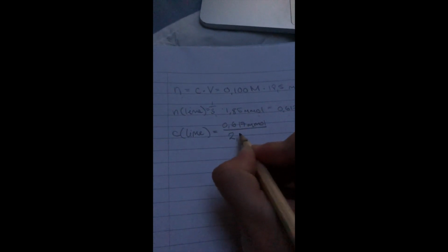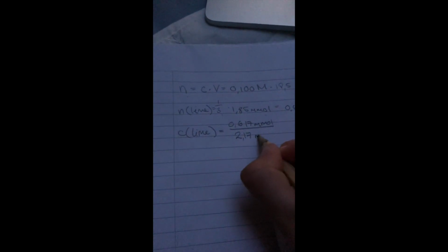So to calculate the concentration, we need to take the number from before, 0.617 millimoles, divided by 2.17 milliliters, and that gives us 0.28 moles per liter.